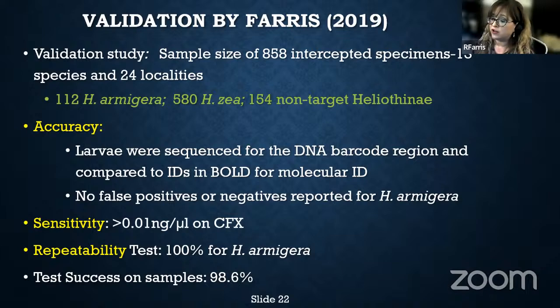The nice thing was that we had no false positives or negatives reported using our validated assay. And for sensitivity, we saw it was the same. It went down to 0.01 nanogram per microliter. For repeatability, I performed these assays in triplicate, and across the board for all the armigera, we got 100% repeatability of the results for the Helicoverpa armigera. Overall, the test success rate was over 98.6%, which was a really good success rate. So we were really happy with that, and we were finally able to validate this assay.